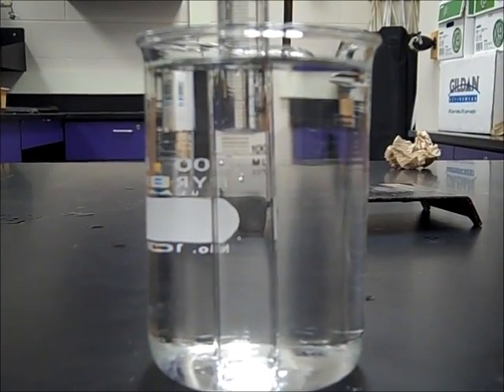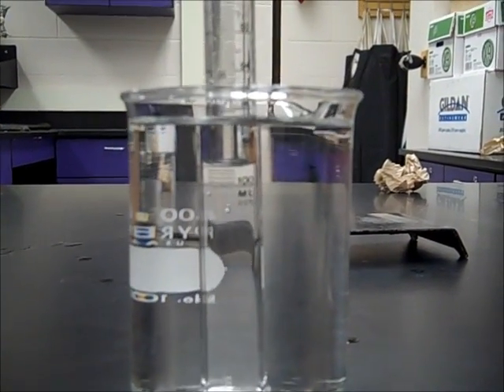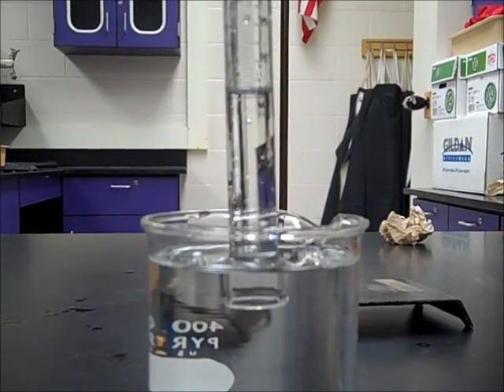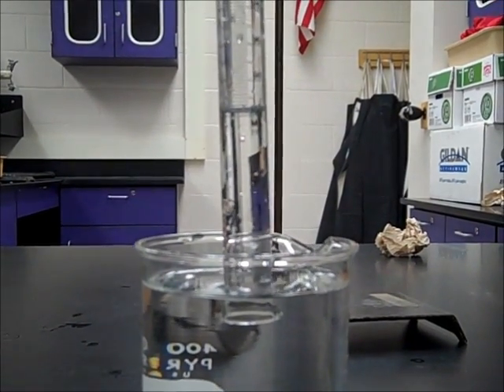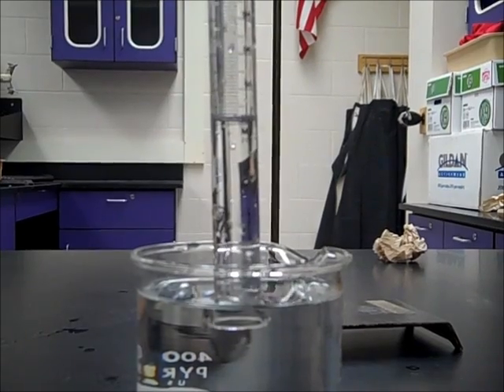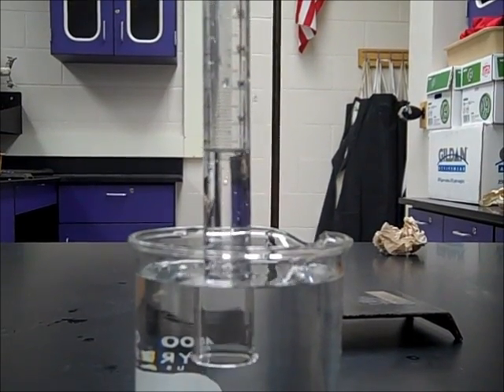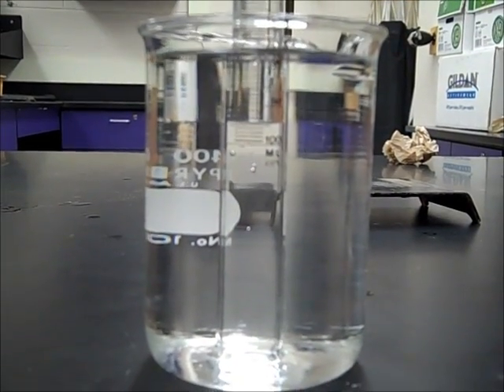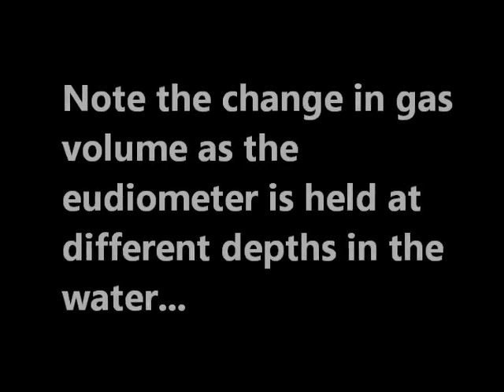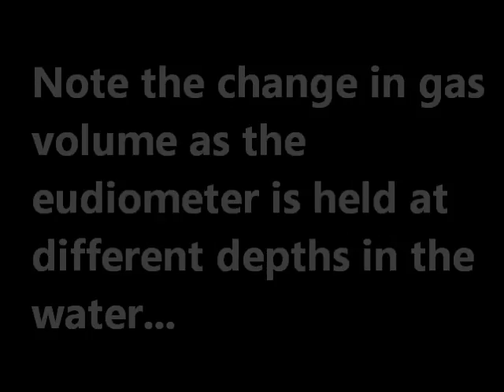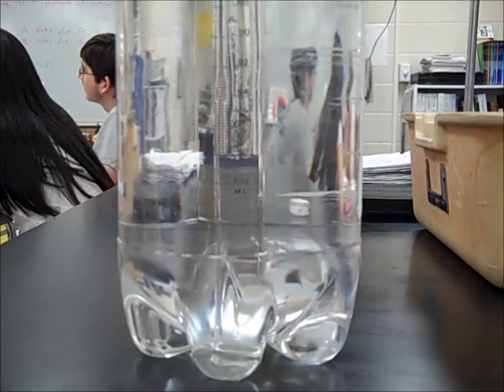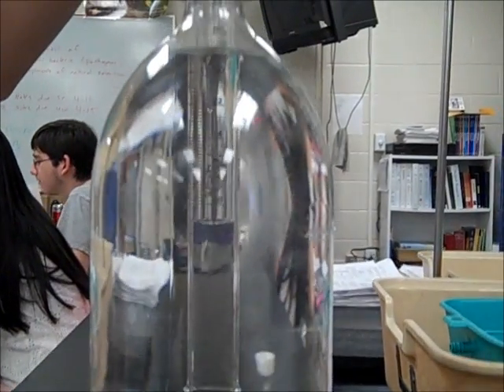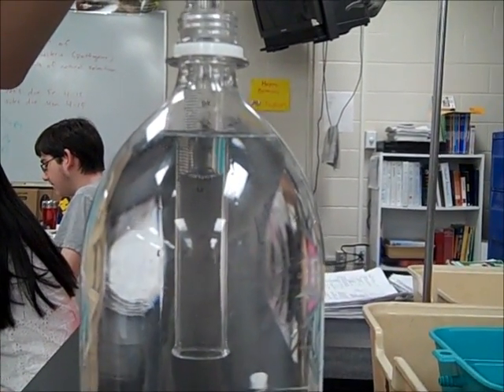Go ahead and raise it up. And stop, and then put it back down, go ahead raise it up, keep going, keep going, keep going, and stop right there.